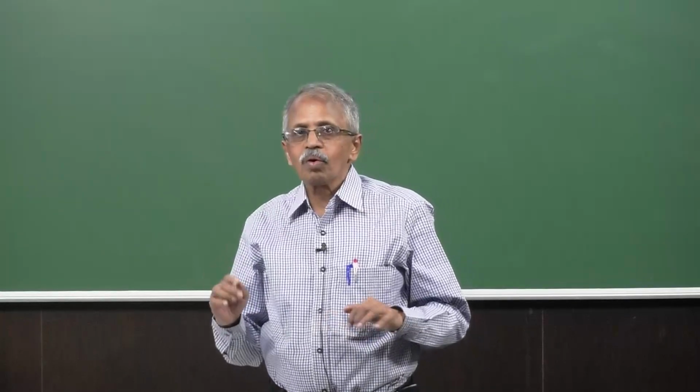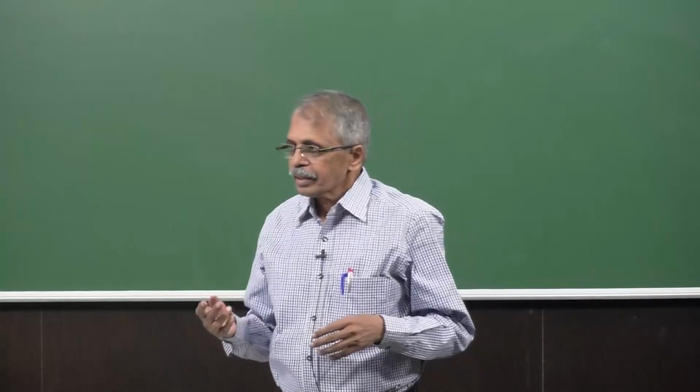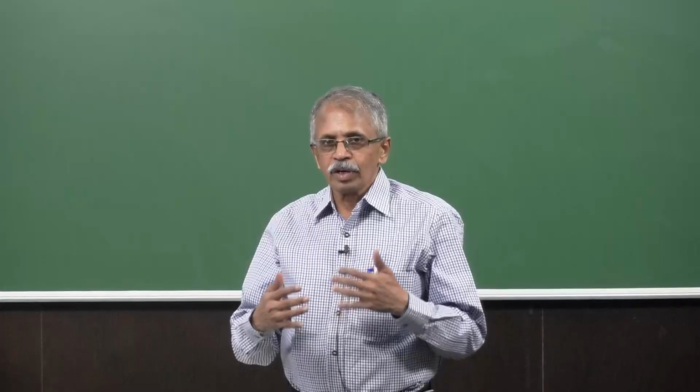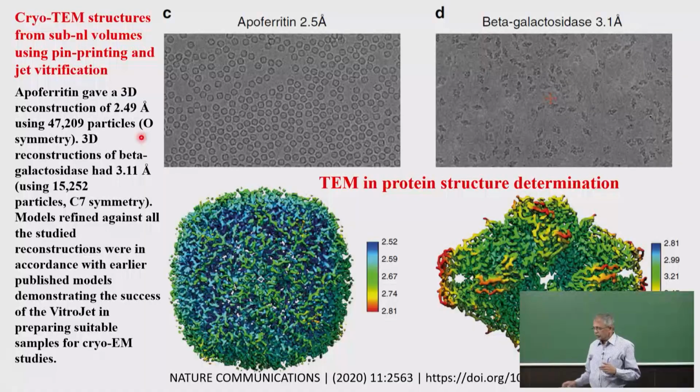So these are all more of an instrument rather than... So instrumental developments give a much higher result in structural aspects. So more engineering inputs are involved, and then comes the chemical and structural aspects into that picture. So 47,000 particles, okay, and the other case here, so you can see this particular shape of this, of course, and that exactly.